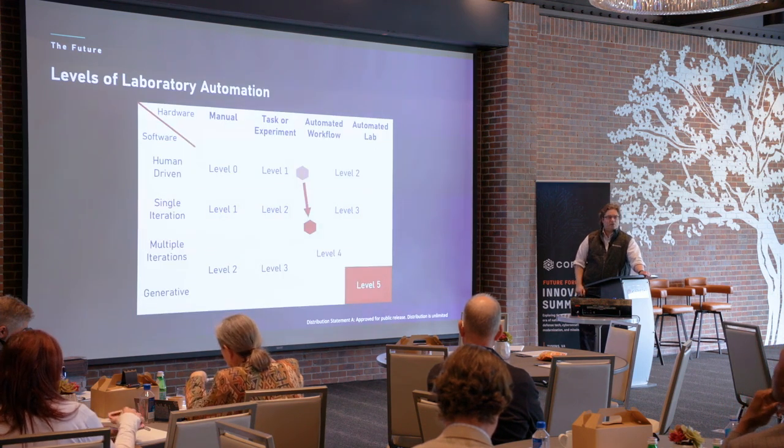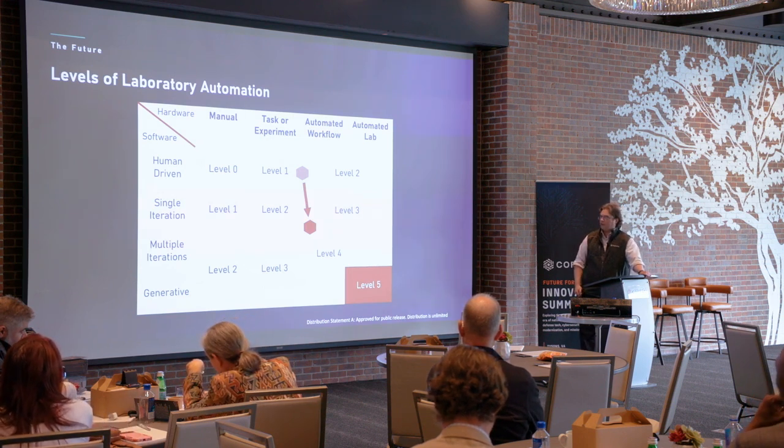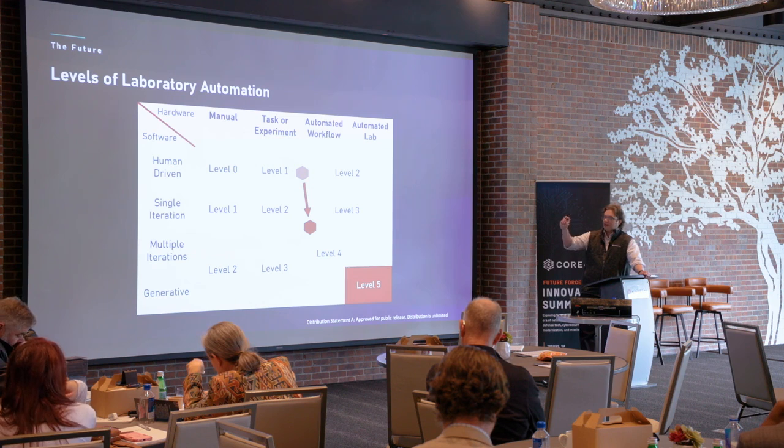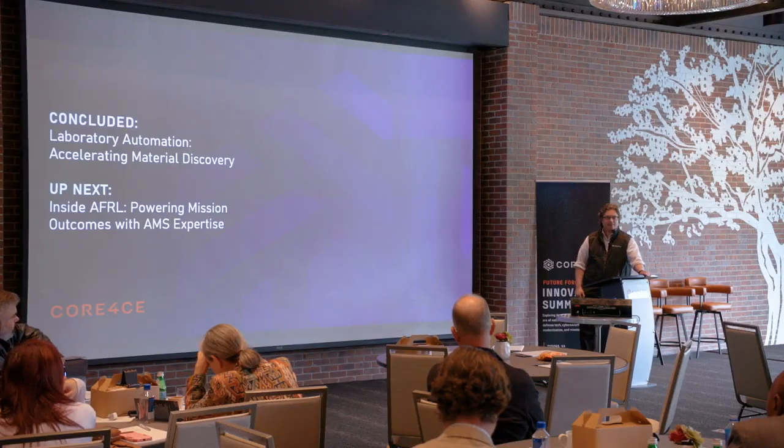If we go back to our original graph of levels of laboratory automation, after these upgrades in the near future, we could possibly be looking at a level 3 or level 4 automation lab.